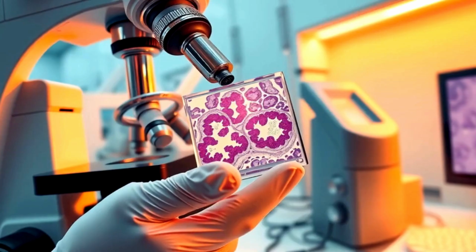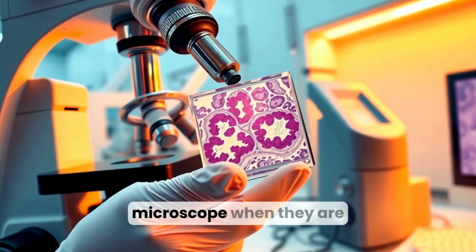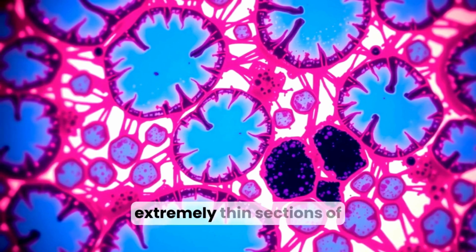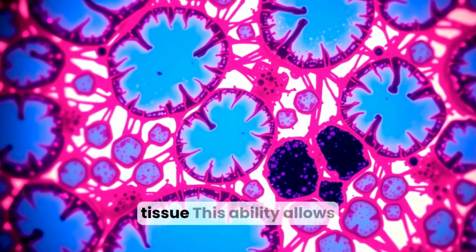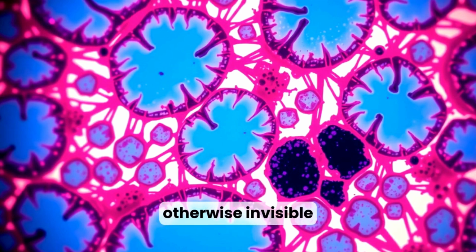Today we explore an essential instrument in histology and cytology that plays a crucial role in microscopic diagnosis, the microtome. Before we begin, let me ask, how do we observe tissues under a microscope when they are naturally thick and opaque? The answer lies in cutting extremely thin sections of tissue. This ability allows light to pass through and reveal cellular detail otherwise invisible.